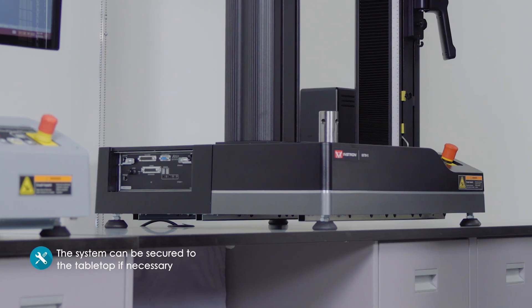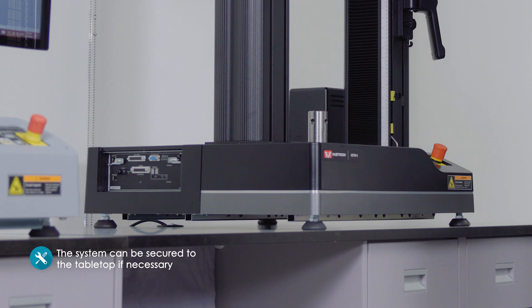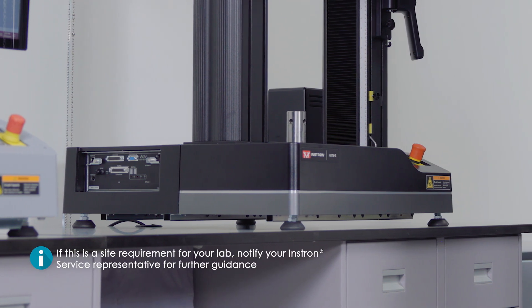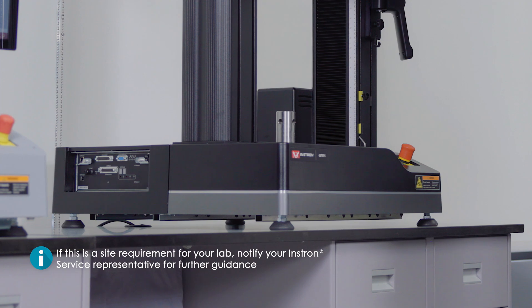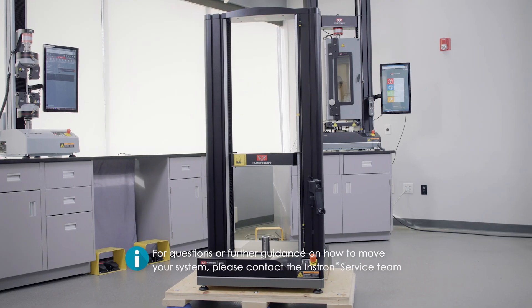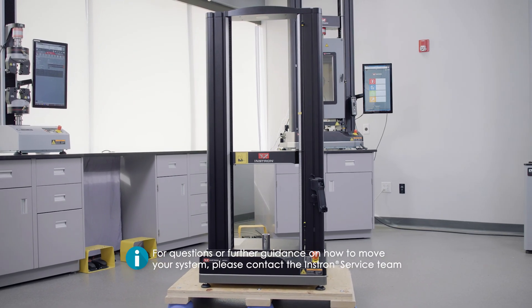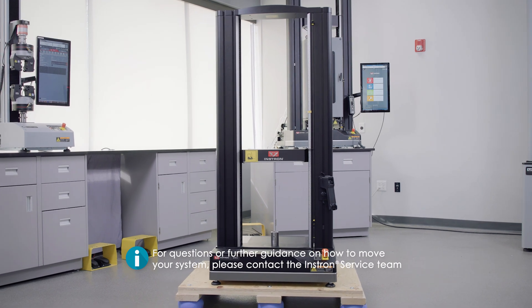The system can be secured to the tabletop if necessary. If this is a site requirement for your lab, notify your Instron service representative for further guidance. If you have questions or would like further guidance on how to move your Instron testing system, please contact the Instron service team.